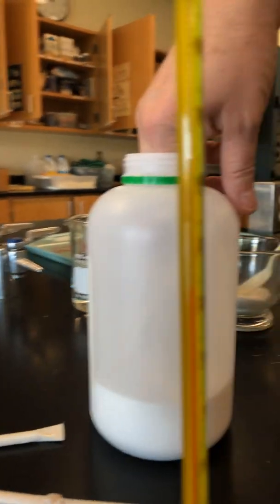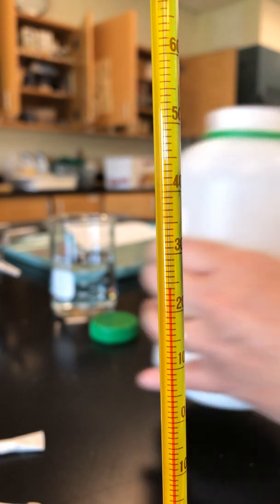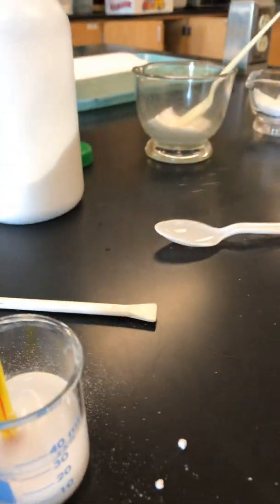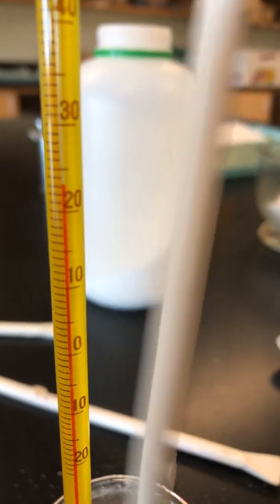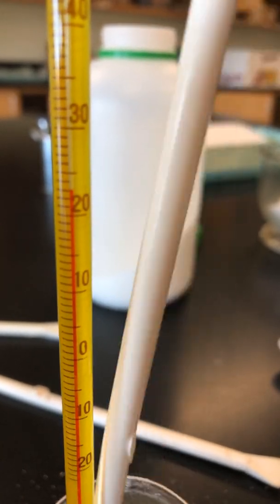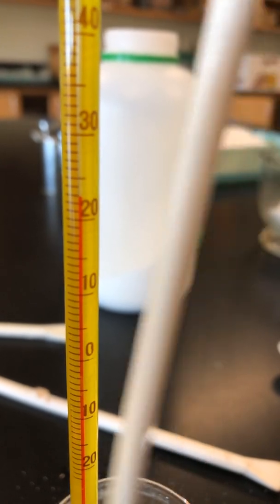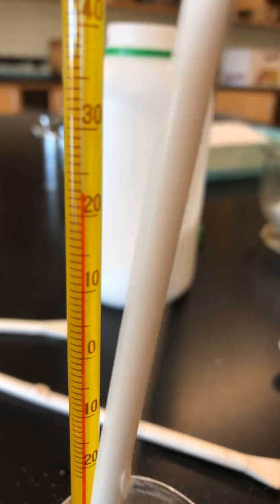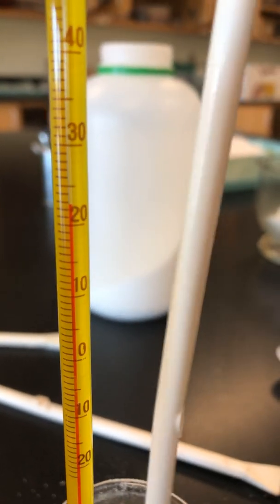So now I'm going to add a scoop of salt C to the beaker. I'm going to start stirring it around and watch that temperature. Is it increasing or decreasing? So notice with this one, the temperature has definitely changed, but the amount of change is much smaller.